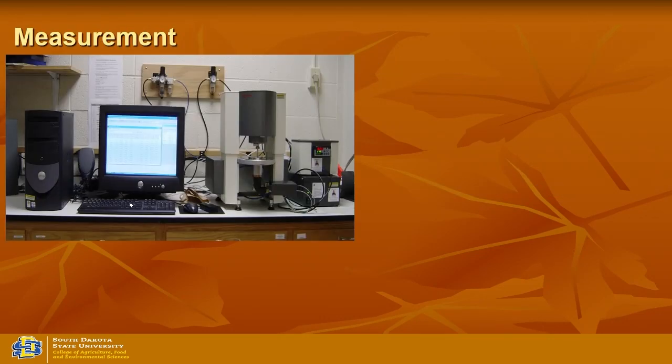So in terms of measurement, this is a typical instrument you use. This one is in our lab. It's called viscoanalyzer, which can be used for both the viscosity measurement and also for the dynamic rheology measurement. You can do the oscillatory shear test here.